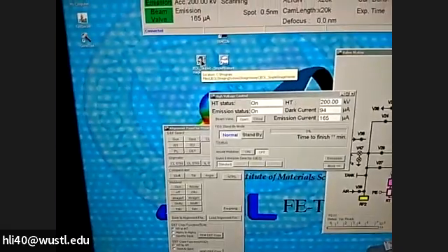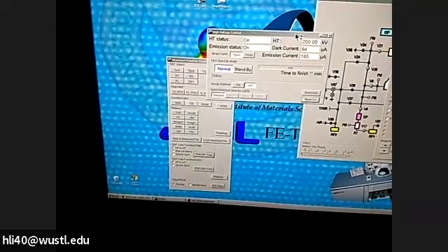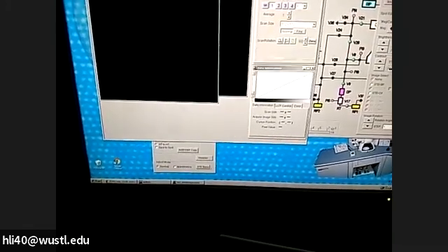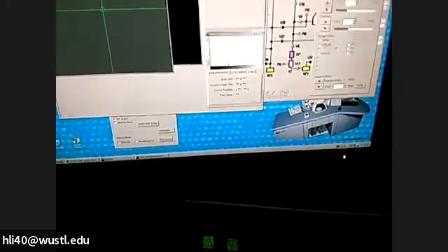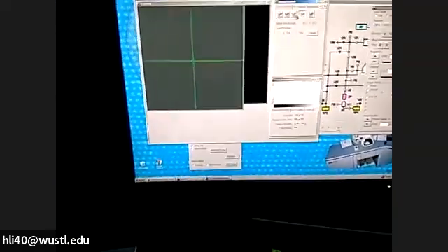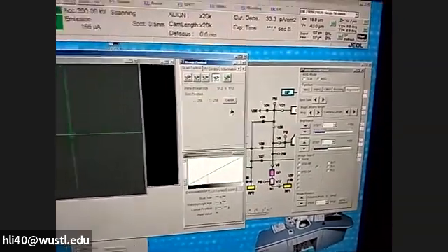Let's start the software called GOL Simple View. In GOL Simple View, if the beam when started is not on the screen, you need to click the scan and spot button — make sure the spot is centered.